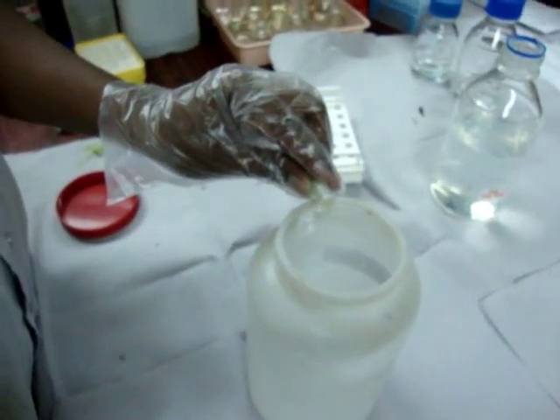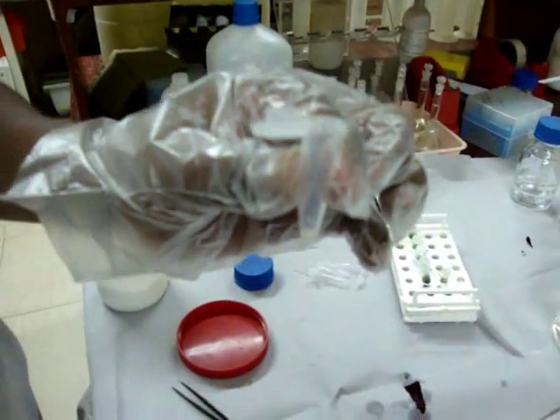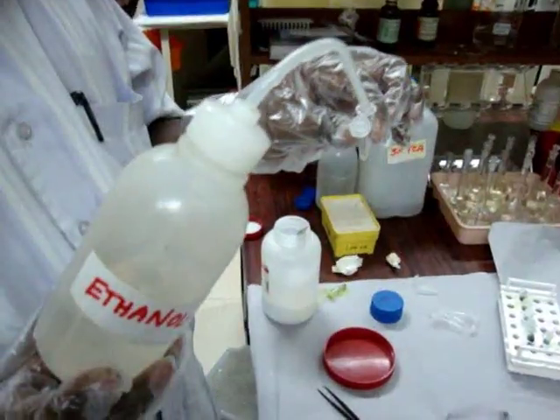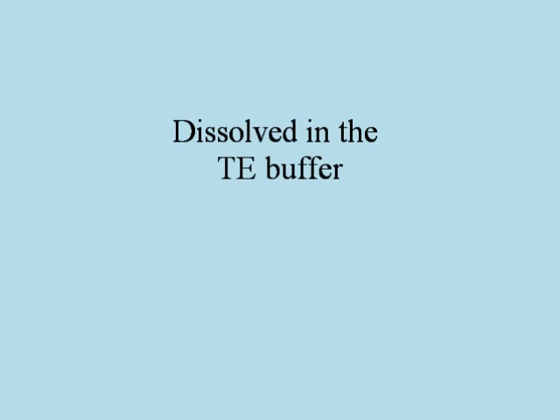The supernatant is discarded and the pellet is washed with 70% ethanol. Then the pellet is air dried. Finally, the pellet is dissolved with 1X TE buffer.